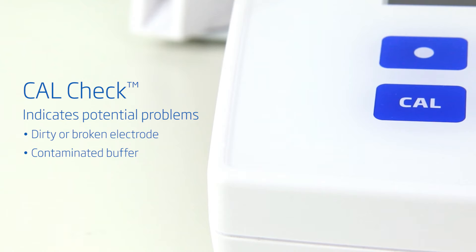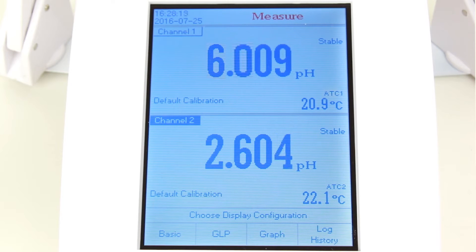After calibration, all the calibration data, including slope, offset, calibration points, and calibration date, are all visible through GLP mode.